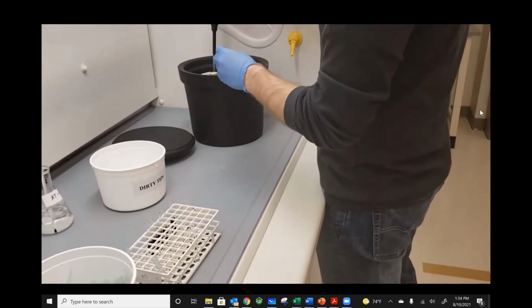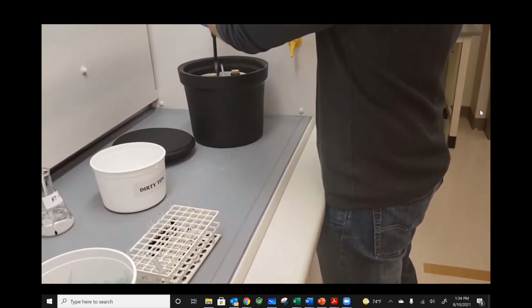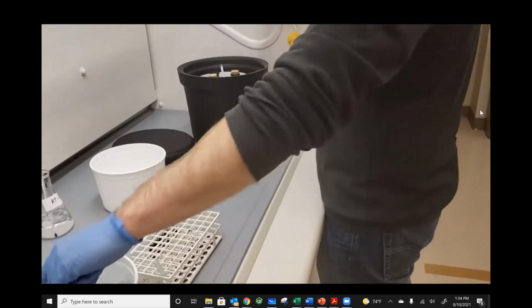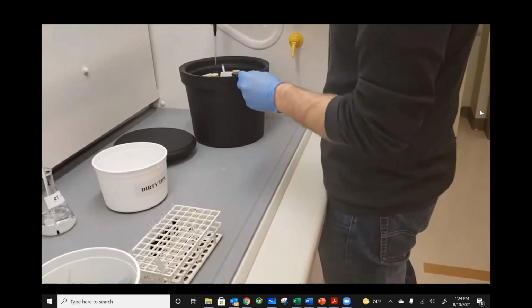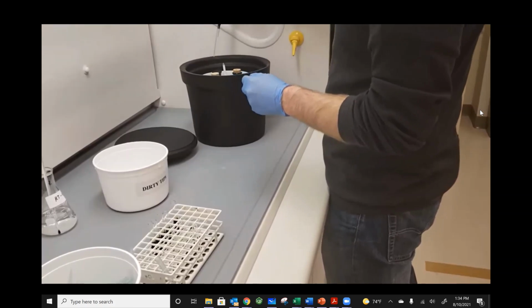That's got a nice bubble in it. Don't like bubbles. Clear. Alright, I don't trust you anymore. Good tip. Things get colder, they don't grip as well. No bubble. Excellent.